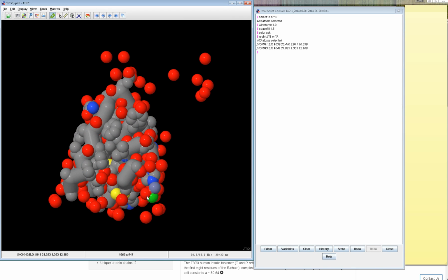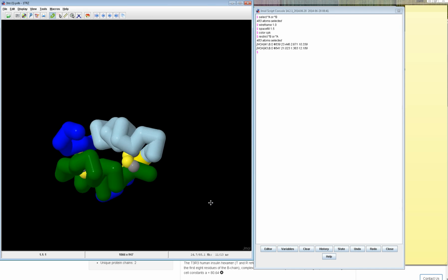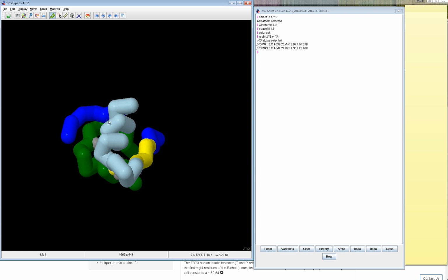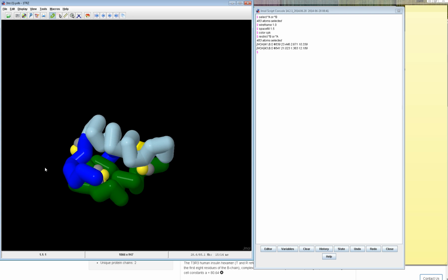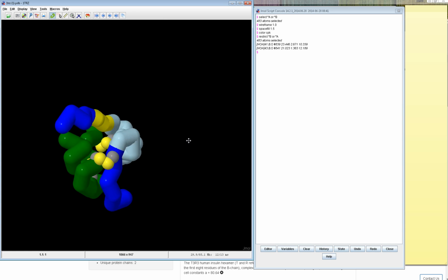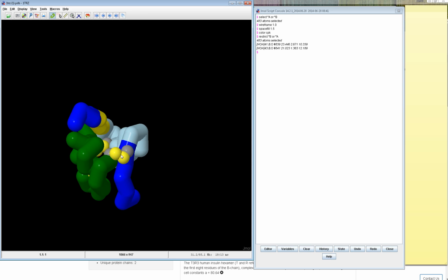But when I undo that into the backbone, you can see these secondary structures like an alpha helix or beta sheets. And that's really important to understand, that when you remove some of these things, you make other things more evident. I've decided to turn on the R groups, or the side chains, of a few of these, and maybe you know this yellow is referring to a sulfur atom. If I hover over this or click it, it's telling me that it's cysteine number 7 on chain A.